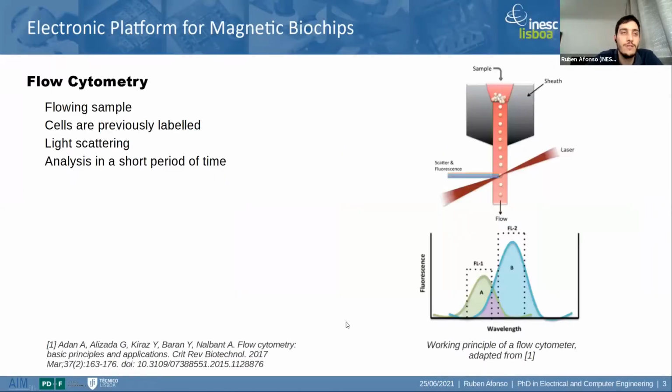Classic flow cytometry is a technique used to count, analyze, and classify microscopic particles in a liquid medium. This analysis is performed by suspending one entity, such as a cell or a bacteria, in a stream and passing them through a sensor. These cells can be labeled, for instance, with a fluorescent marker or not, and in this case, we use interference light patterns to detect it.